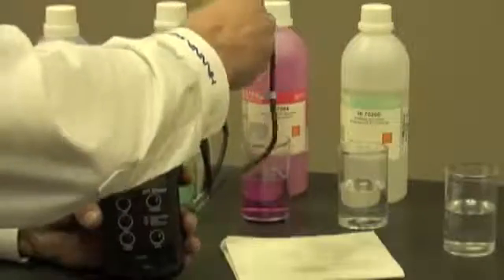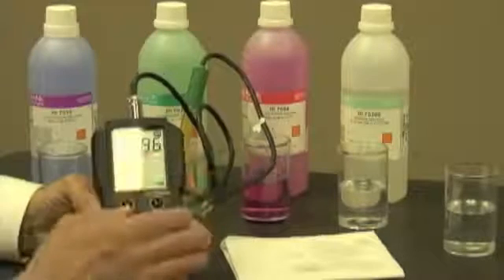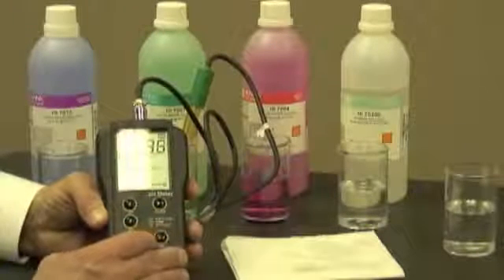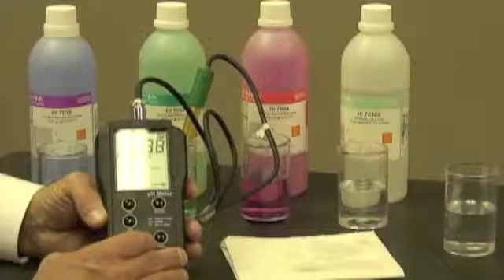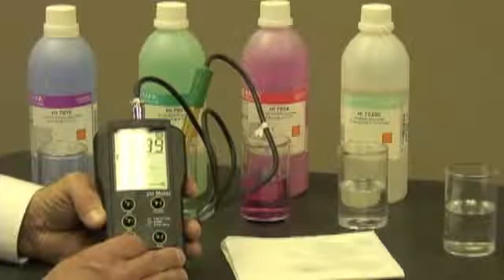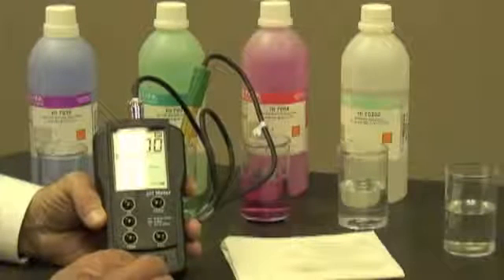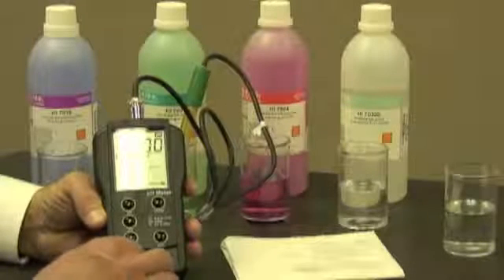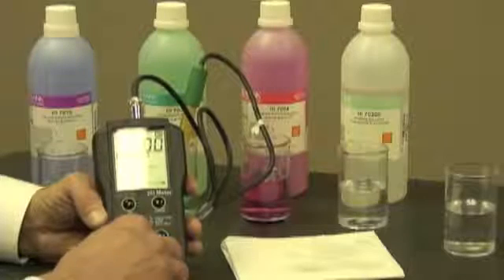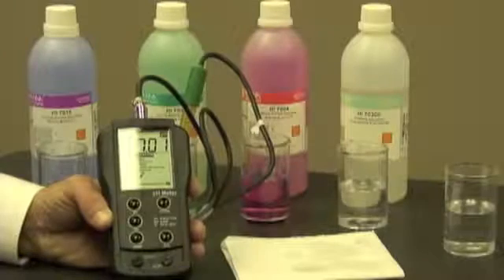The meter is asking me to put the probe into a pH 7 buffer solution, which is what I've just done. I'm going to let that take a reading. The meter says 6.99, so what I want to do is adjust the offset to 7.01. I'm going to turn the knob.